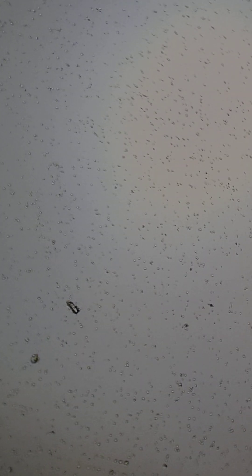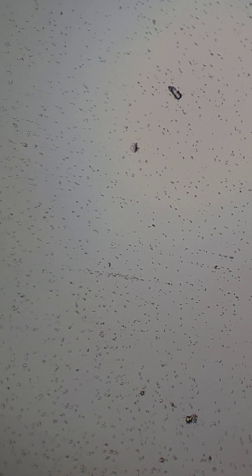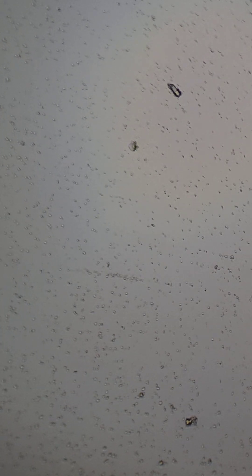Nothing really, just reduced particles. The other side of the edge. I'll do a little more of the portal object. I doubt the drop reached this. Oh no, it's still there. Yeah, this is reduced particles.